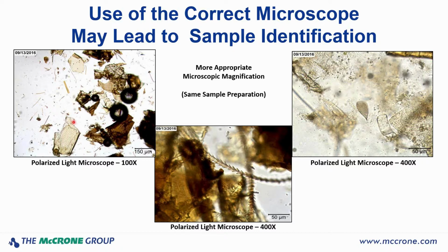It's very easily seen that we've got all kinds of insect parts here. These are bits of antennae and hair, insect hairs and things like that. That's at 100x. We come over to 400x. Here is a moth or a butterfly scale. If you look down here in this location, we've got these hairs. That's a bat hair. All of this insect material, very little other material, and the bat hairs tells me that this is consistent with a bat guano.